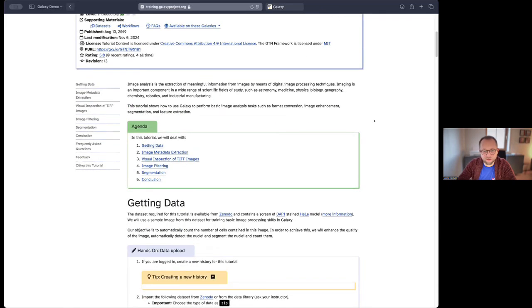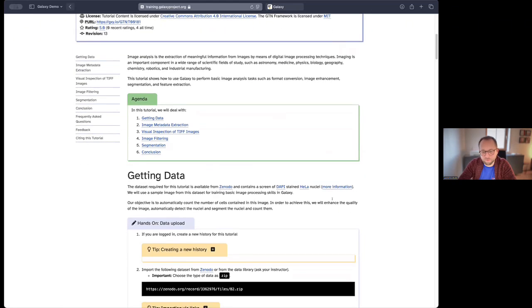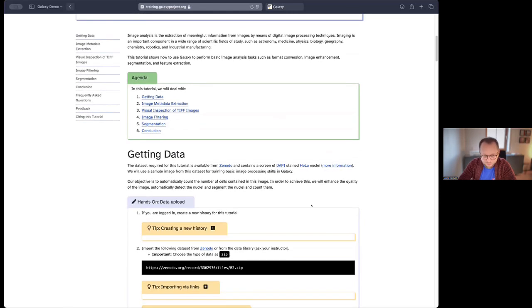What we are concerned with here is an image that has DAPI-stained HeLa nuclei. We will see how it looks in a moment.